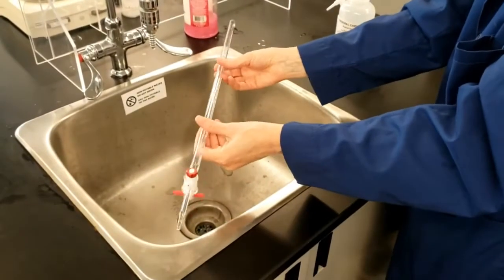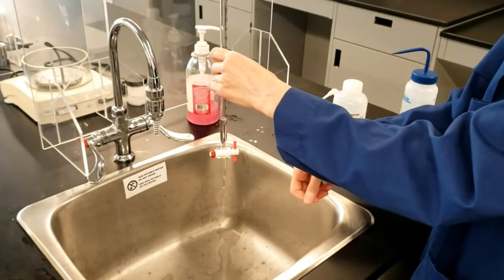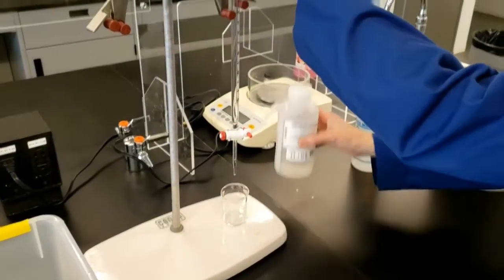Next, rinse the burette at least 2 times with the titrant solution. This will replace the water coating with a coating of titrant. Secure the burette to a stand using burette clamps and make sure it is vertical. Fill the burette with titrant to a point above the 0 mark.